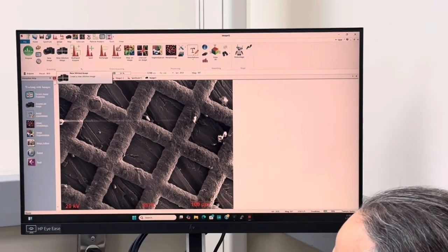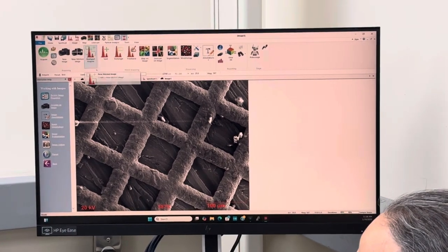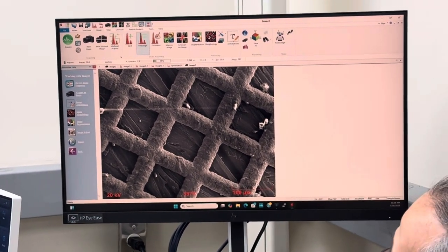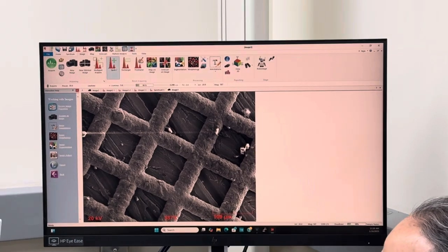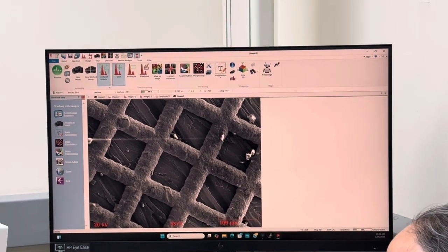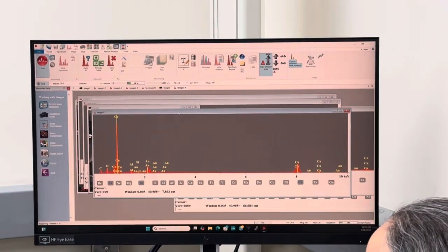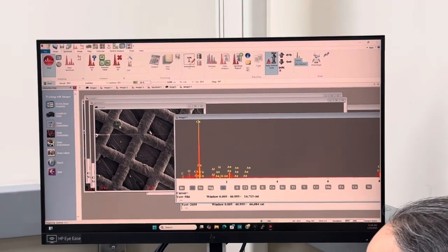and in the imaging tab, that's what I'm in, imaging tab, that's the spectra tab. If I'm in my imaging tab, then it gives me other features to do. Like I could click on a spot and find out what that spot is made out of. I'm just going to shrink the windows so I could see. Right, so that's an individual spot.